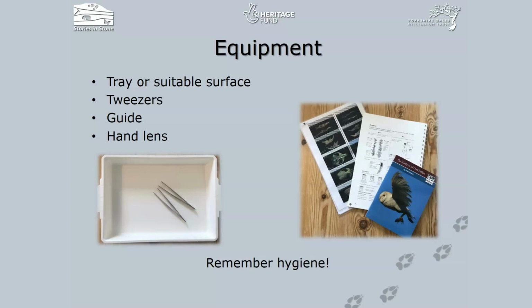Another thing is the guide. I've got my preferred options, but there are a lot of things out there. What you might want to do is download the handout that comes with this video, because I've taken some free resources from the PB, and I've put those on there. There are also some links to alternative identification guides. As with any identification guide, it's a case of having a go with different versions and seeing what suits you best. People take to different guides and keys differently.